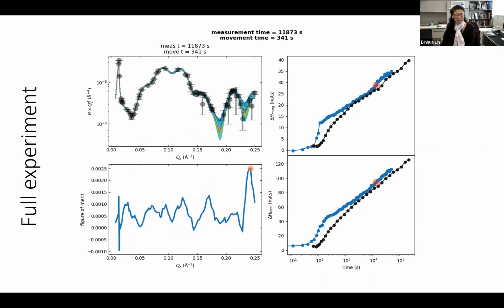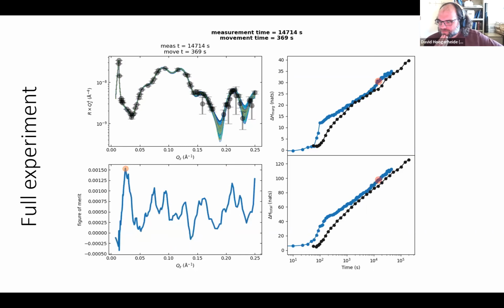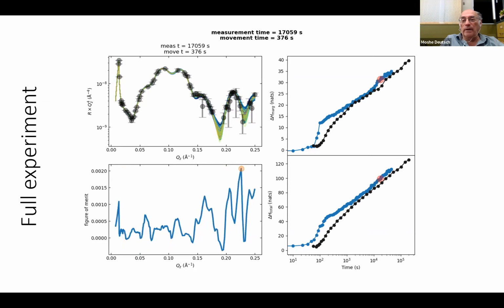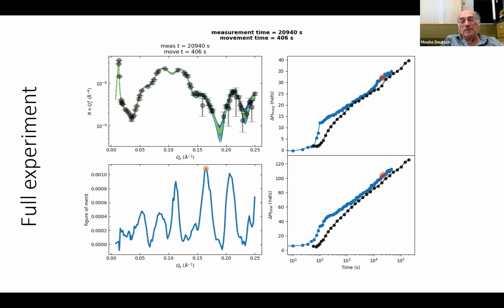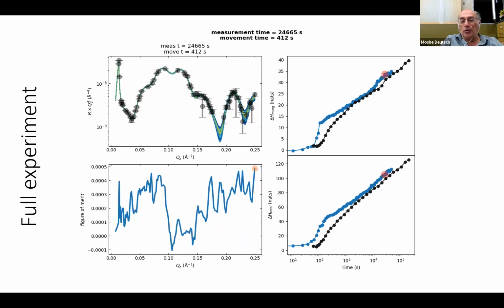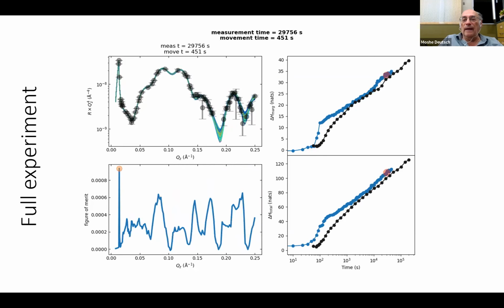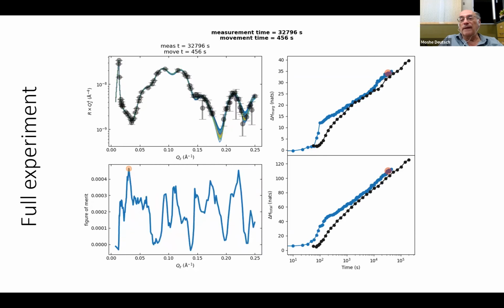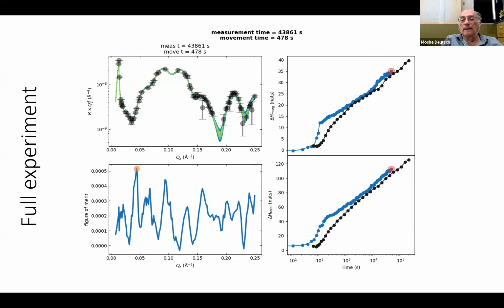I also have a question, if possible. Sure. The way you take the points is jumping from point to point. Now suppose what happens in X-rays, not in neutrons, that the beam drops. You end up having a partial reflectivity curve with some points here and some points there.